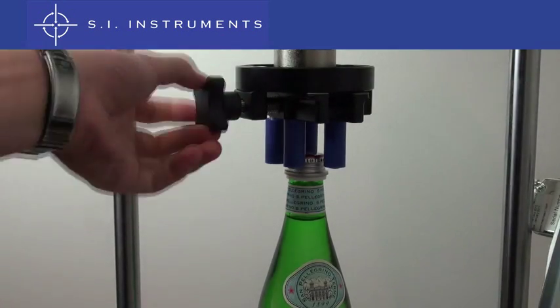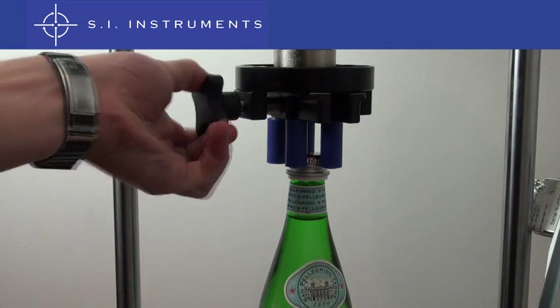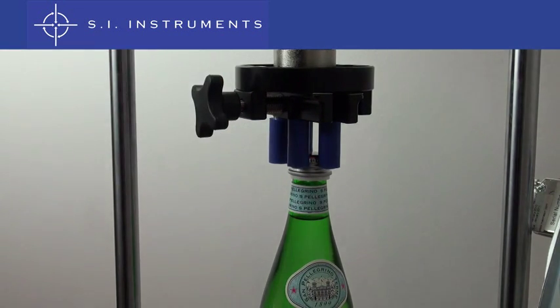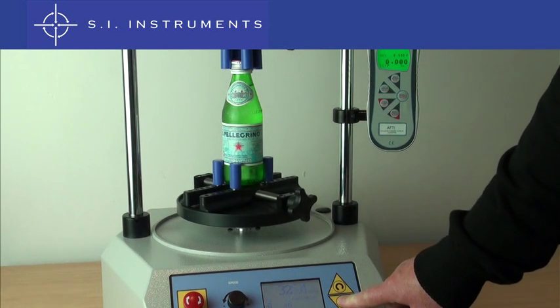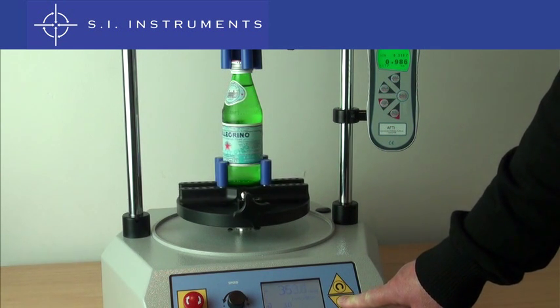In this example, we are testing the cap torque of a soft drink bottle. First we clamp the bottle into the bottle holder plate, then the centre bar is lowered, the pegs are tightened and we are ready for action.